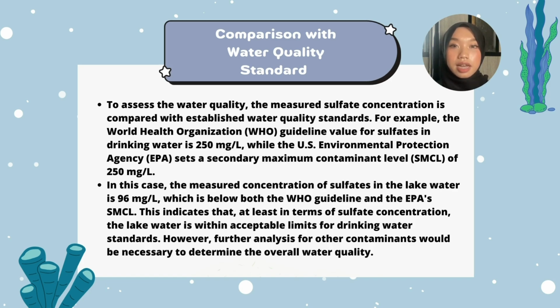This indicates that, at least in terms of sulfate concentration, the lake water is within acceptable limits for drinking water standards. However, further analysis for other contaminants will be necessary to determine the overall water quality.